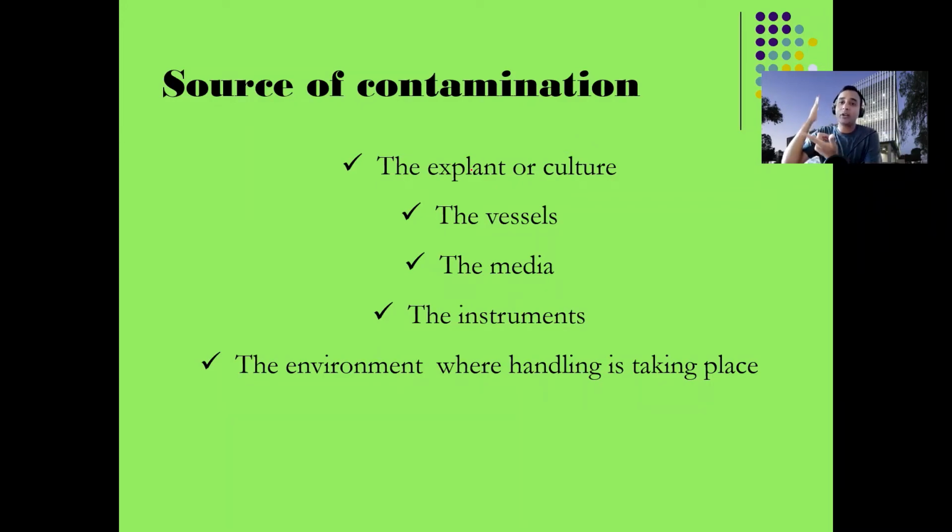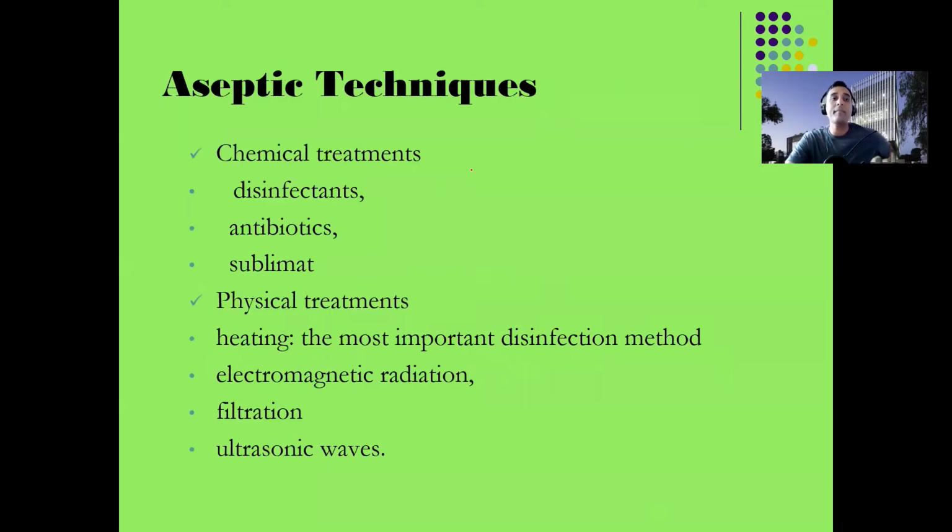The sources of contamination are everywhere. It could be your culture or explant. It could be your vessel. It could be your media. It could be the instruments you are using. And it could be anything coming from the environment, okay. So there are many sources of contamination, okay.